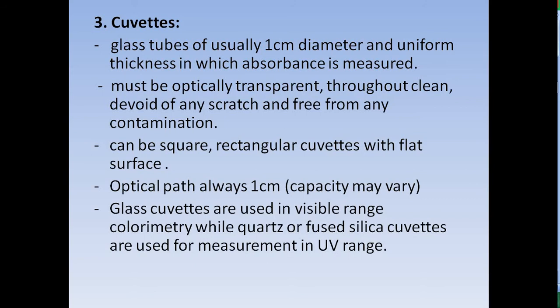It can be square or rectangular with flat surfaces, or it can be cylindrical. But usually, if cylindrical, the diameter is 1 centimeter, and even if it's square, the length of the side is 1 centimeter. The optical path is usually 1 centimeter, but the capacity may vary.